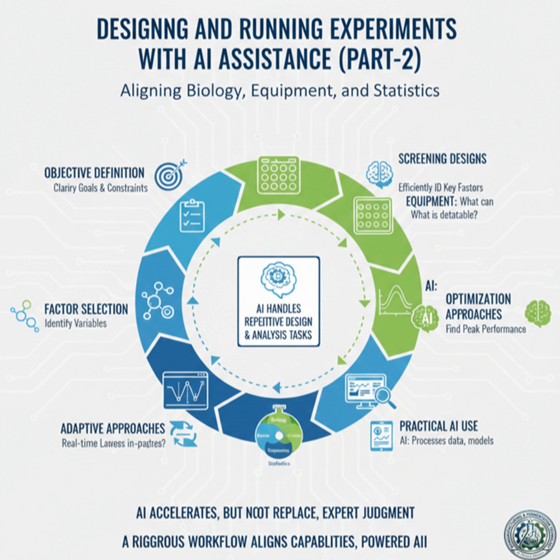Okay, so we have our objective, and we've set our boundaries so we don't kill the yeast. Now we get into the actual design, the strategy. The sources break this down into 2 main phases, screening and optimization. Let's start with screening. This is the wide net approach. Exactly. Imagine you're starting a new process with a new strain. You have 20 different factors that might matter. Magnesium, trace metals, glucose feed, temperature, impeller speed. And you genuinely don't know which ones drive the bus. You have no idea. And you can't test every combination.